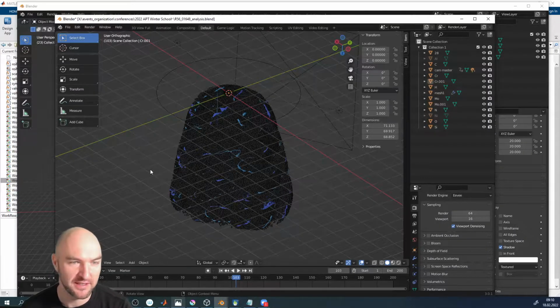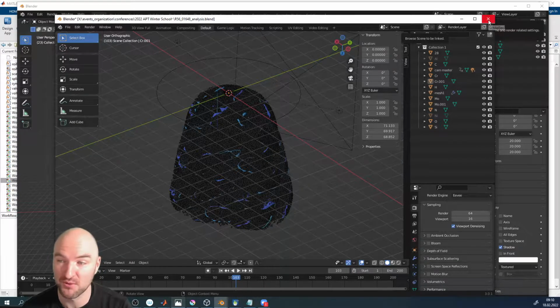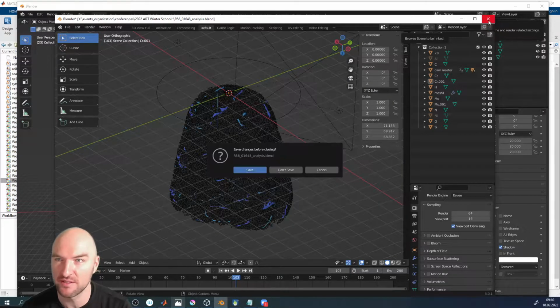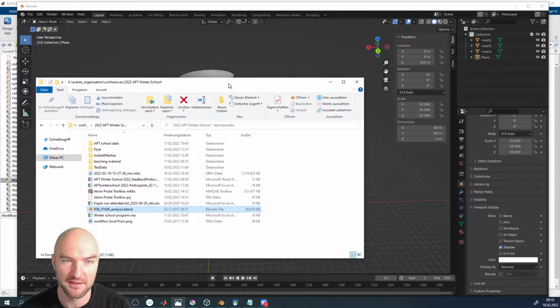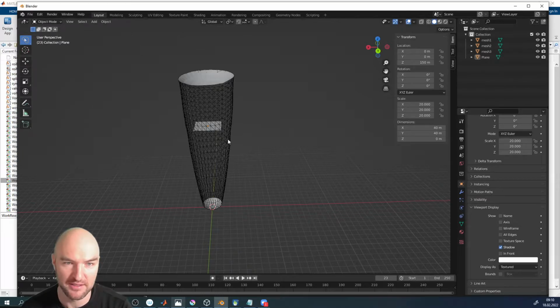Okay, so let's jump right into it. What are the interesting bits? What can we model that we couldn't model otherwise? Well, very importantly, it's things like grain boundaries. I think we're just going to start with a very simple grain boundary, and then we can relate our analysis to that grain boundary.